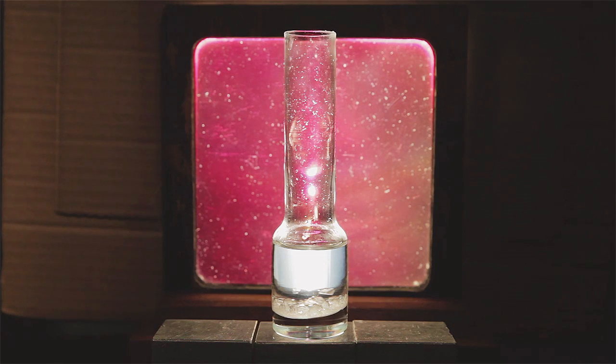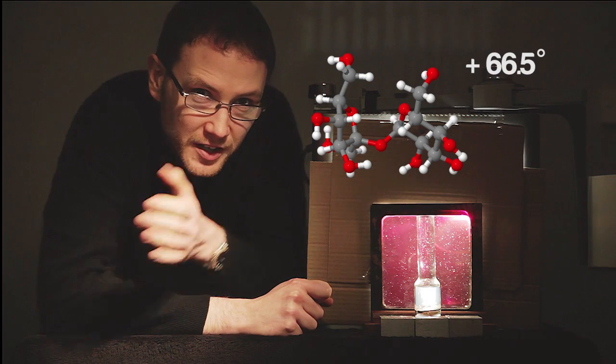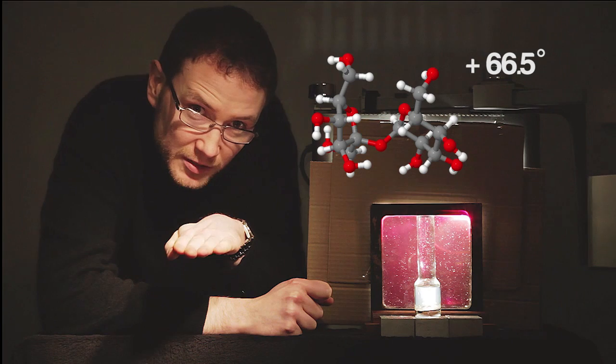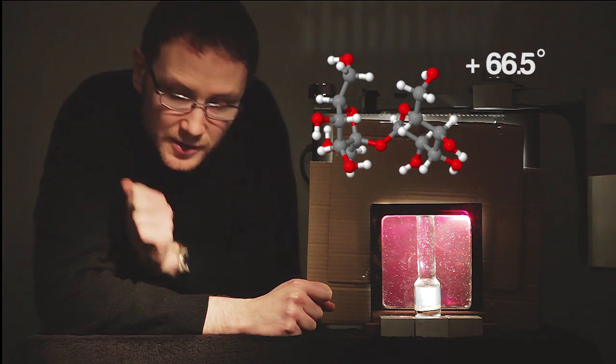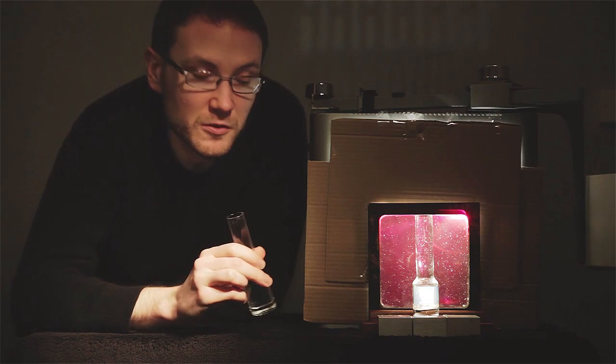This is a solution of sucrose. It's a chiral molecule, and it's dextrorotatory, i.e. it rotates plain polarized light to the right, so it's now able to pass through the second filter. Other sugars, like glucose and fructose, are chiral too.